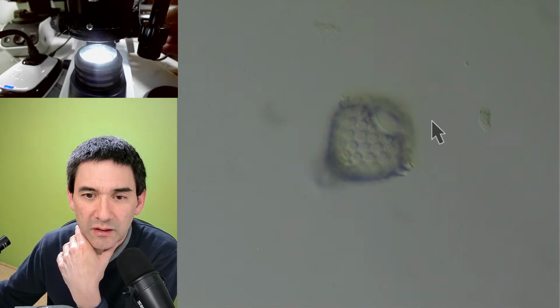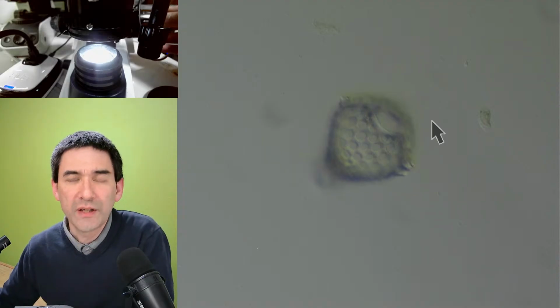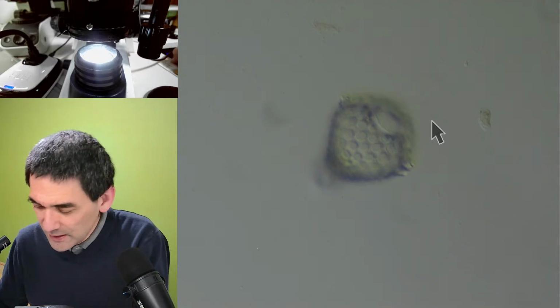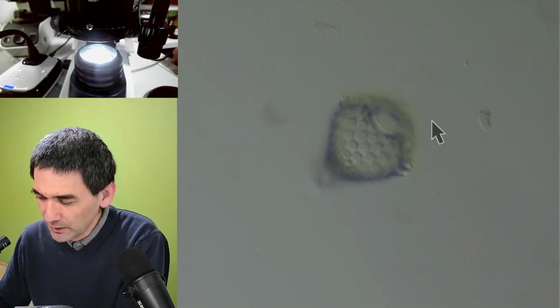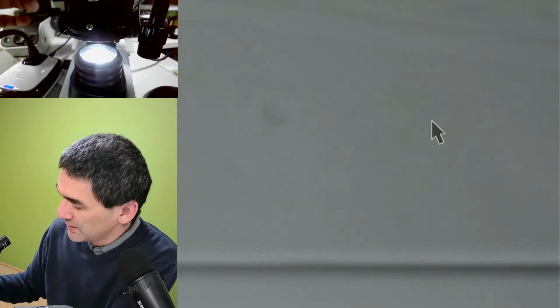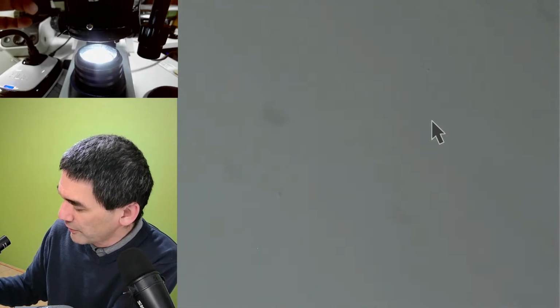Okay, so every now and then I'm reading the comments again. That's why I'm pausing a little bit. So what else is there? Let's have a look. Maybe this one over here. Let me see. This is a part of a leg of a bee.